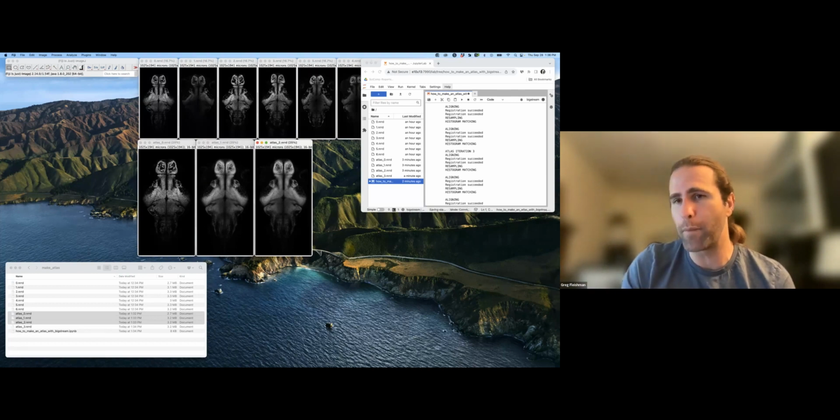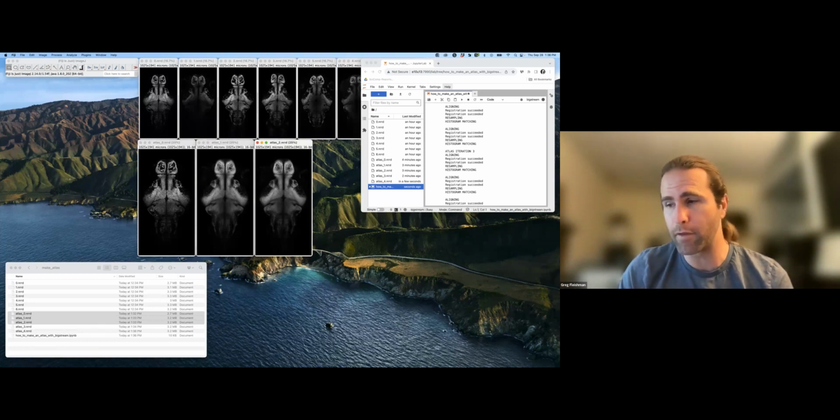So then you would use the common channel across all subjects in order to produce the atlas. That's the most standard, reliable thing to do. You could do other things if you got creative.